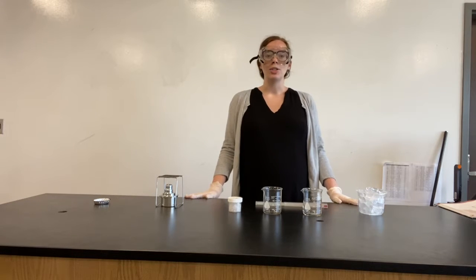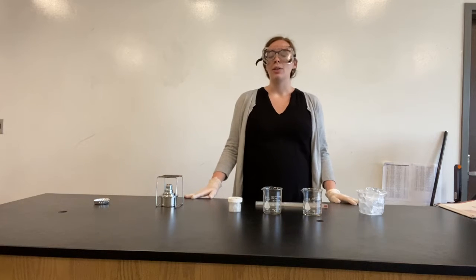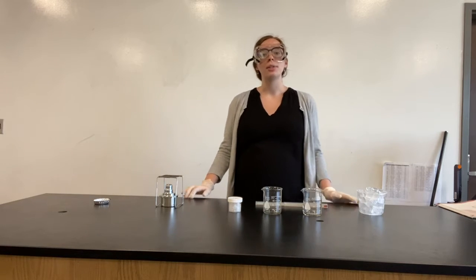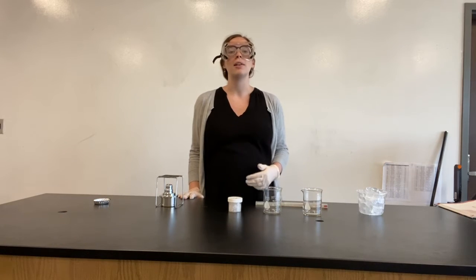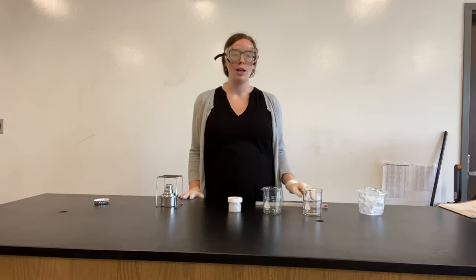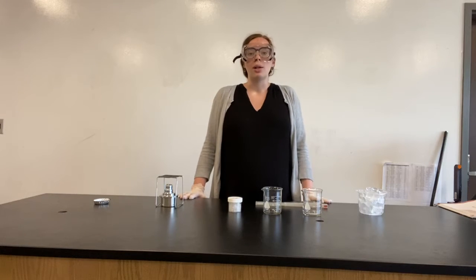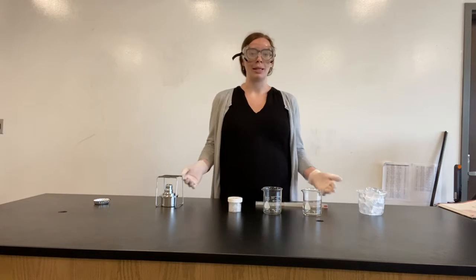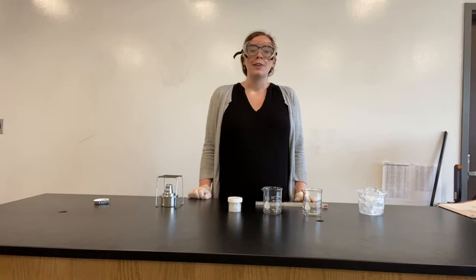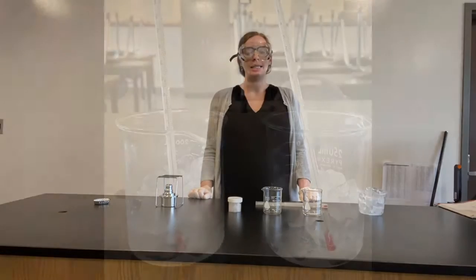This is a demonstration of Labs 5.1 through 5.3, Changing Mixtures. Now, last time we looked at how some mixtures could be distinguished by the different individual properties of the substances in the mixtures. However, today we're going to look at how some mixtures can have entirely new properties based on what's been mixed together. Specifically, we're going to be looking at the properties of melting point and boiling point today.